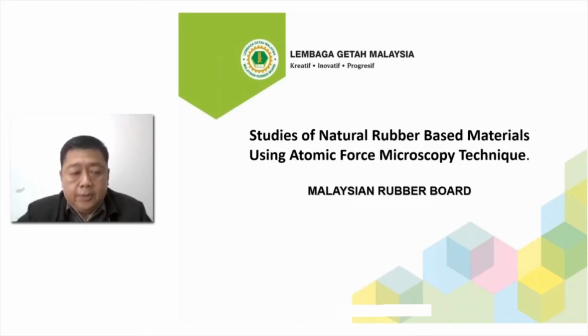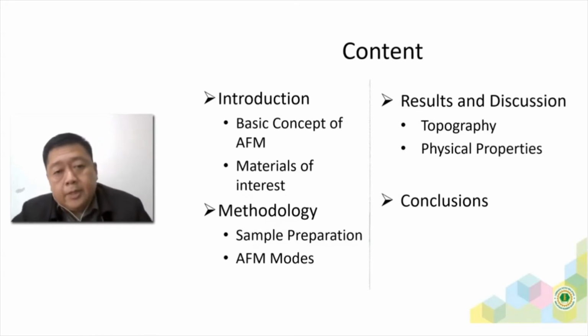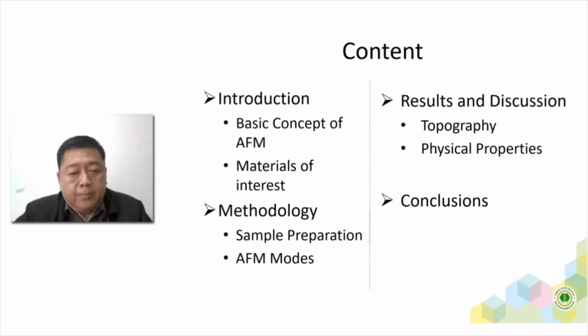So the title for today's presentation is the studies of natural rubber-based materials using AFM technique. First of all, I will share a little bit about the basic concept of atomic force microscopy and the materials that we are interested in. And I will also share with you the preparation method for the samples that we made.